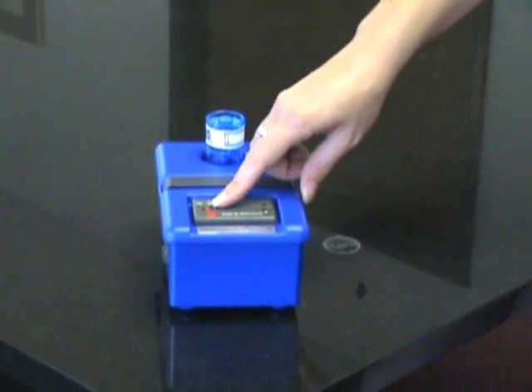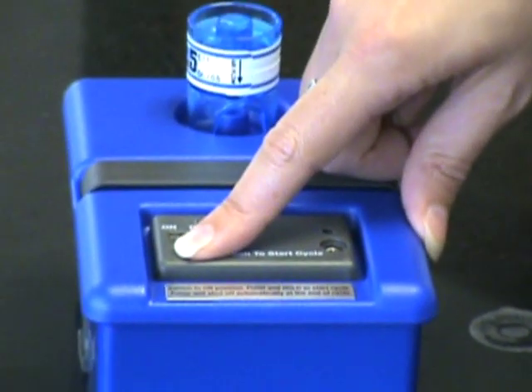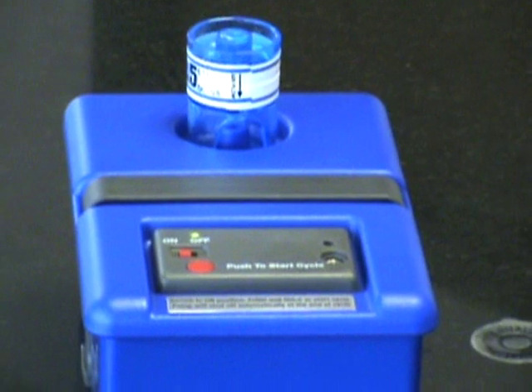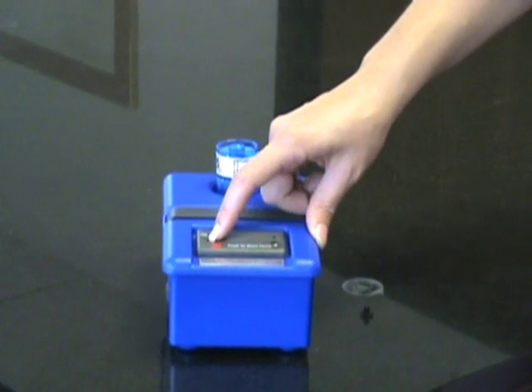Move the red power switch from the off to on position. Press and hold the red on button until the pump starts — a green light will turn on. The pump will automatically shut off after 5 minutes. When this occurs, turn the power switch to the off position.